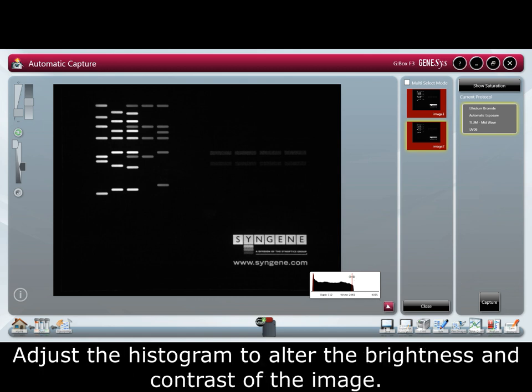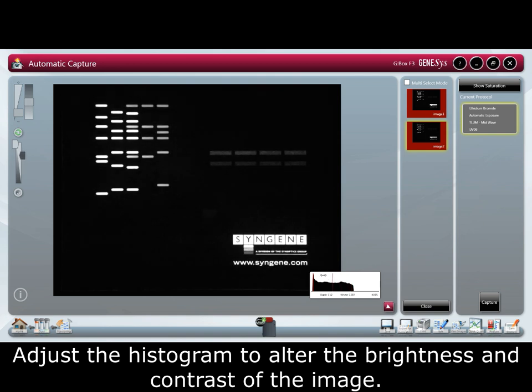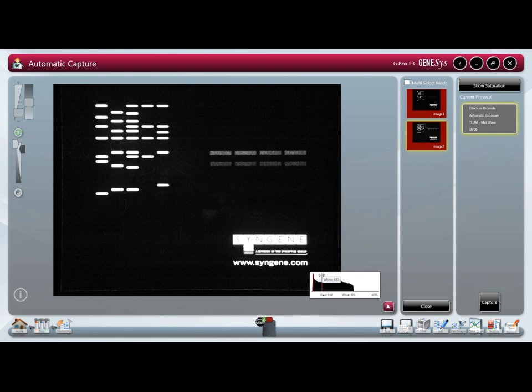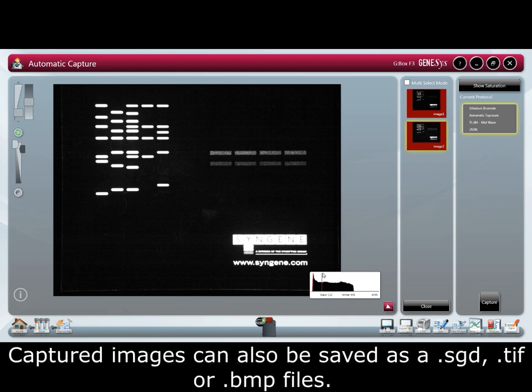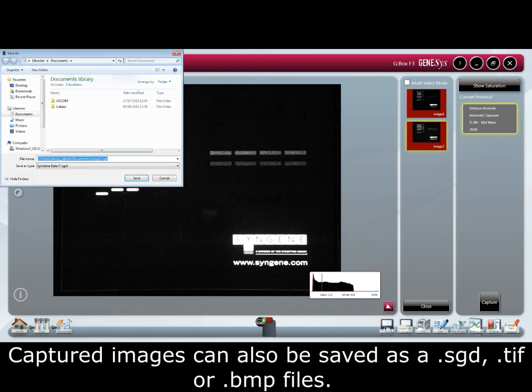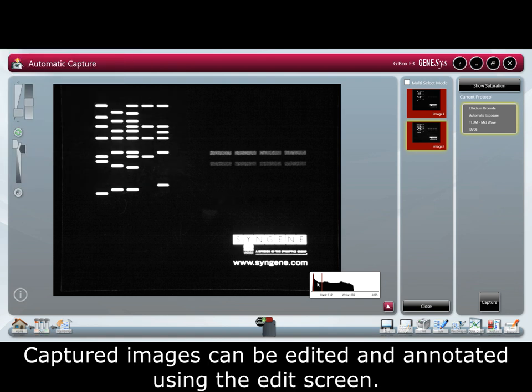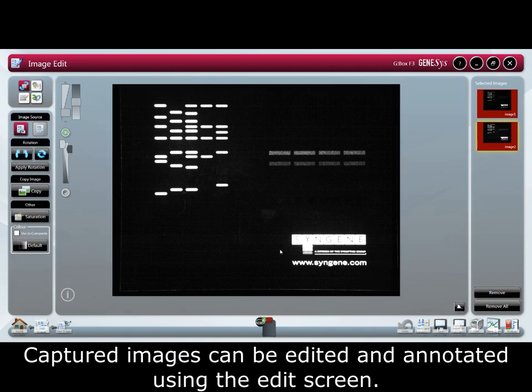Adjust the histogram to alter the brightness and contrast of the image. Captured images can also be saved as an SGD, a TIFF, or a BMP file. Captured images can be edited and annotated using the edit screen.